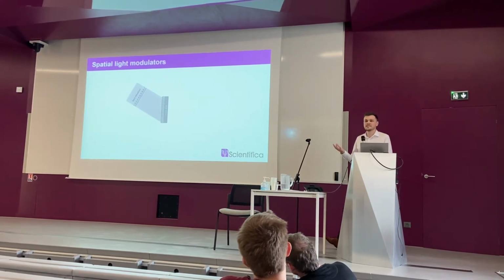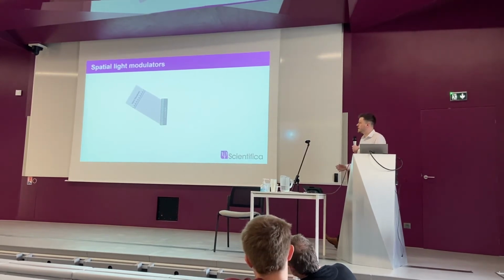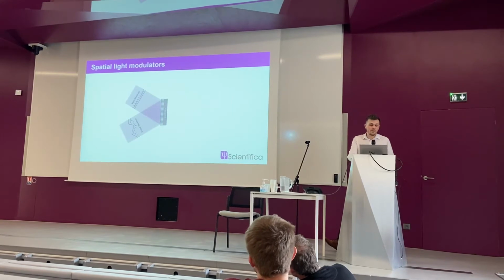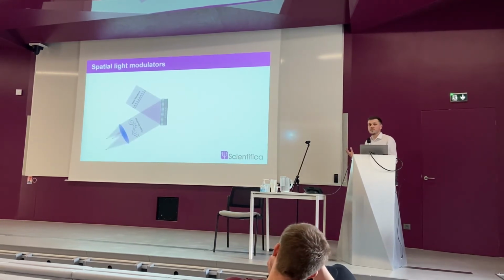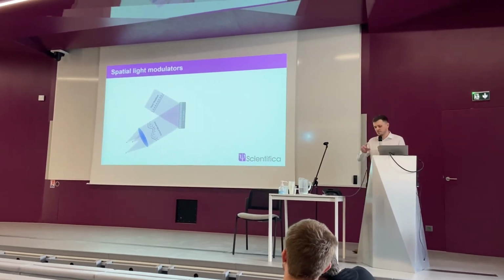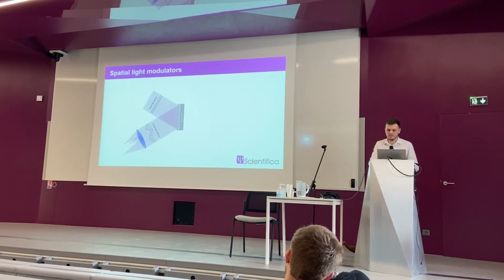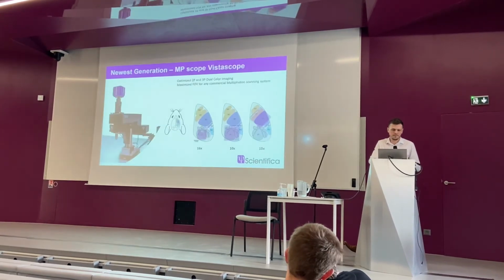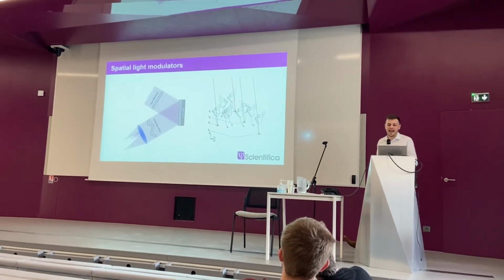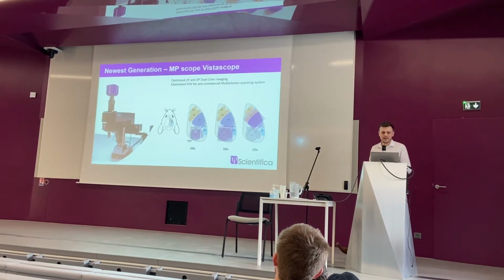It can be a pretty standard 2-photon laser or go to very, very powerful lasers for many of these spots. That then shapes the beam, creates an output wavefront, which then when focused through the objective gives you many focal points in 3D. It's all designable through the software, click, click, click, click, click, and you design the experiment that way. Or you can sort of just use your galvos, spiral around on the cells and activate optogenetic tools and things like that.